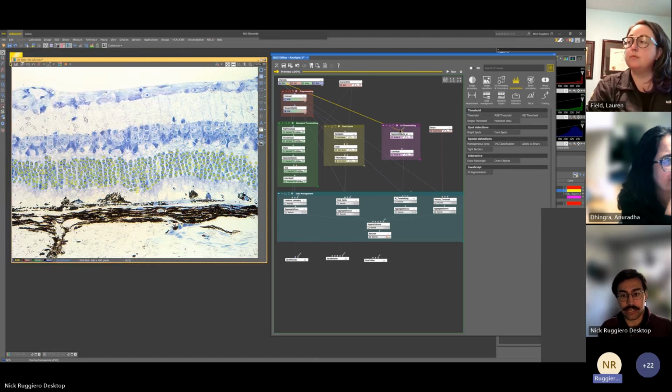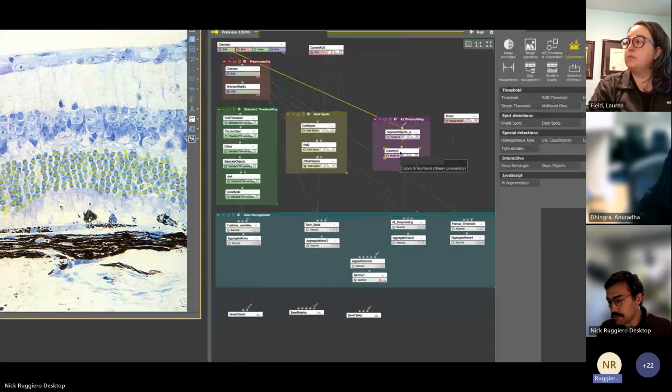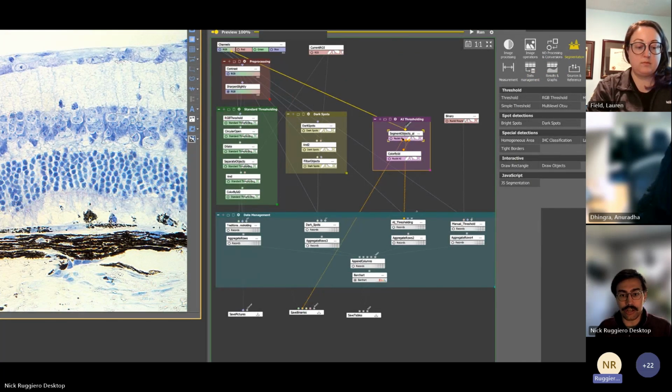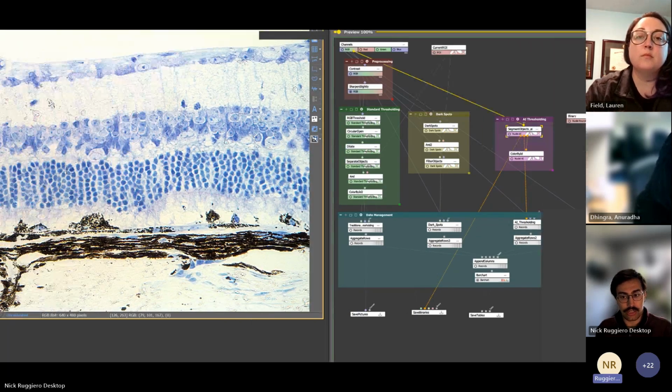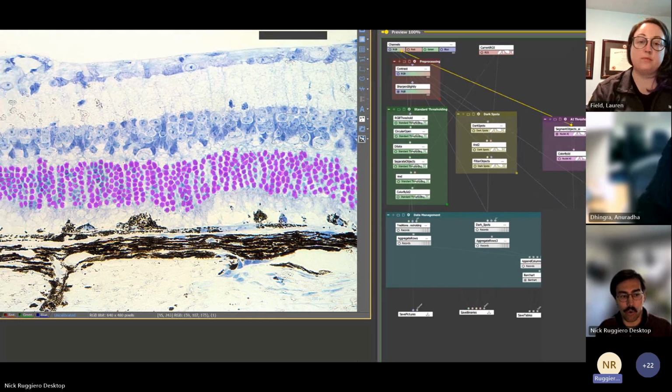The really nice one is this one that we did with our AI thresholding. You'll notice that aside from, let me see, can I zoom in a bit on that? Does that look good? Yes. Aside from this color by ID function, which again is just going to relabel them, this is the only function in this method of thresholding. And when we look at our whole image, you can see that it does a really good job of picking out only the nuclei in this central area here. I didn't need to use the AND function to get rid of some extra stuff on the outside.